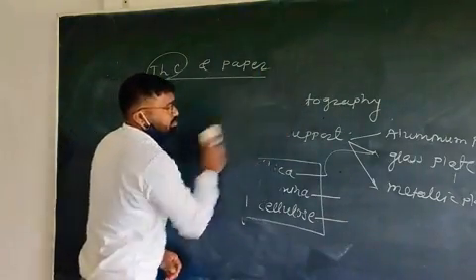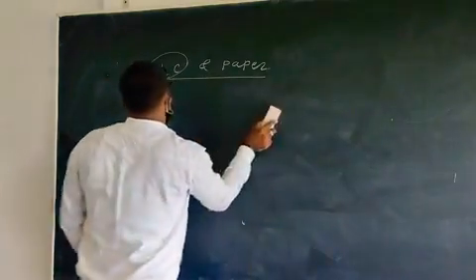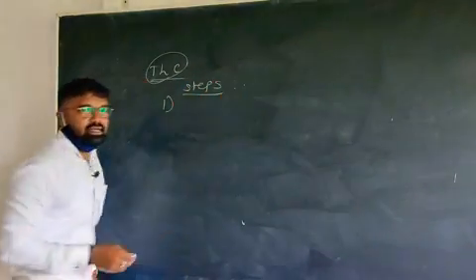During TLC, or thin layer chromatography, some basic steps are used, right? I am writing the steps here.